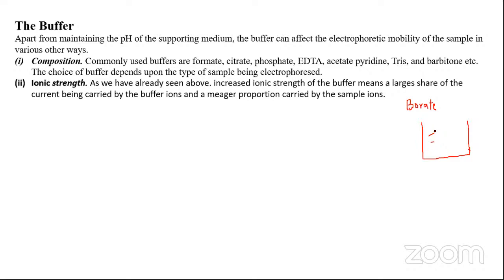So then what he did was that he was more concerned about a darker band. So he actually purified a darker band. That means he isolated BSA from this gel. He used this darker band and he reloaded it onto the same gel and performed electrophoresis in borate buffer again. Okay, he again got 2 bands.